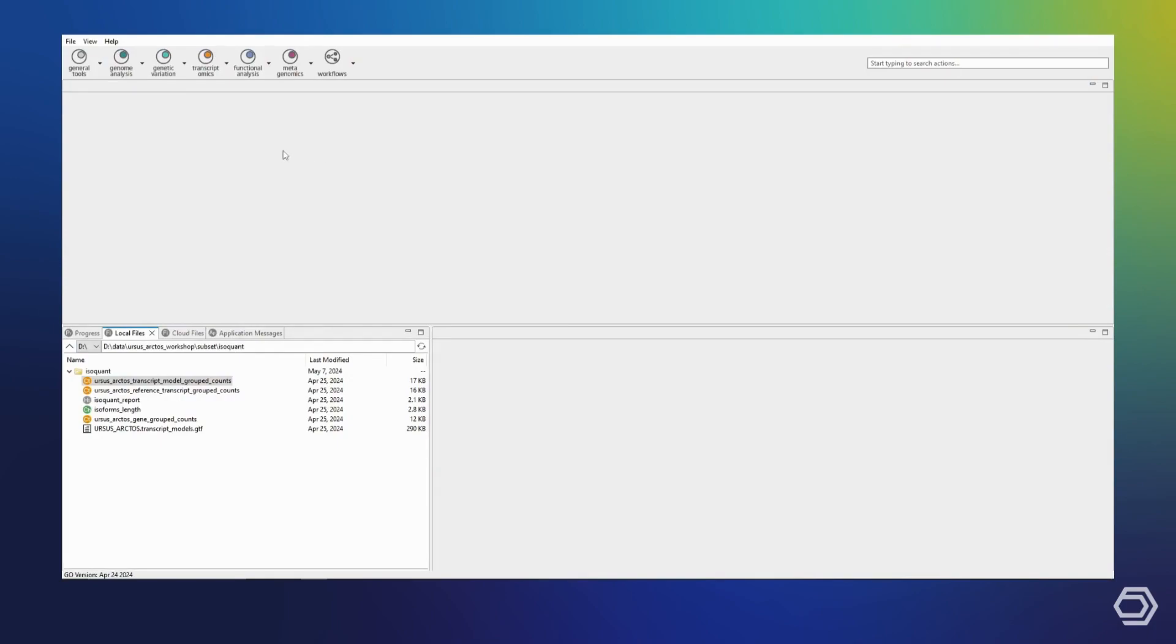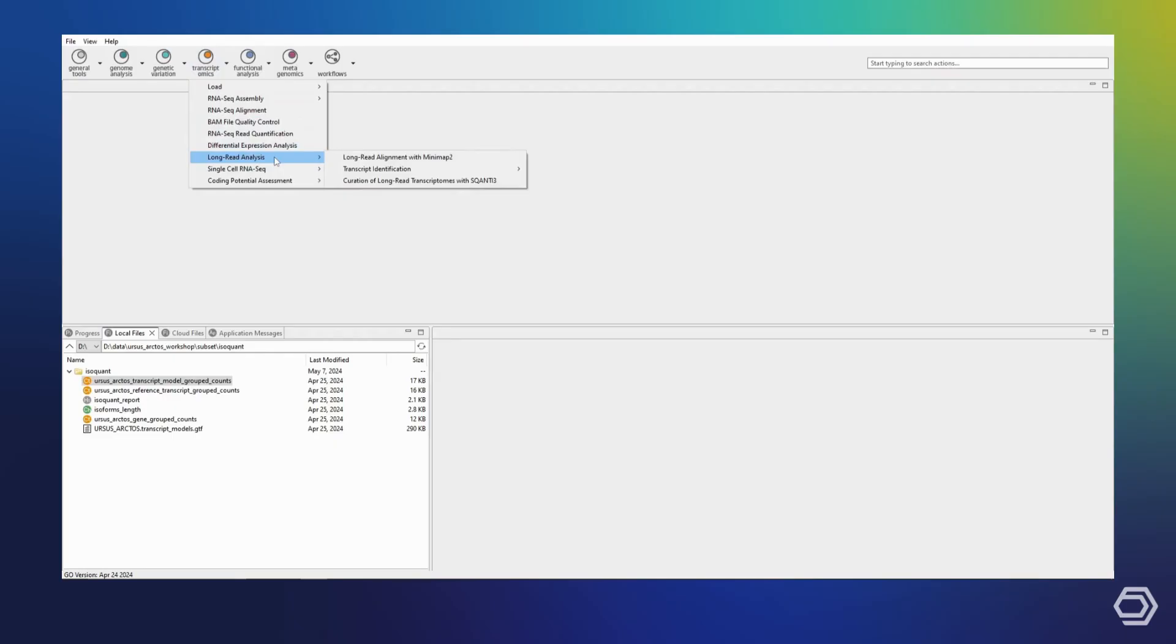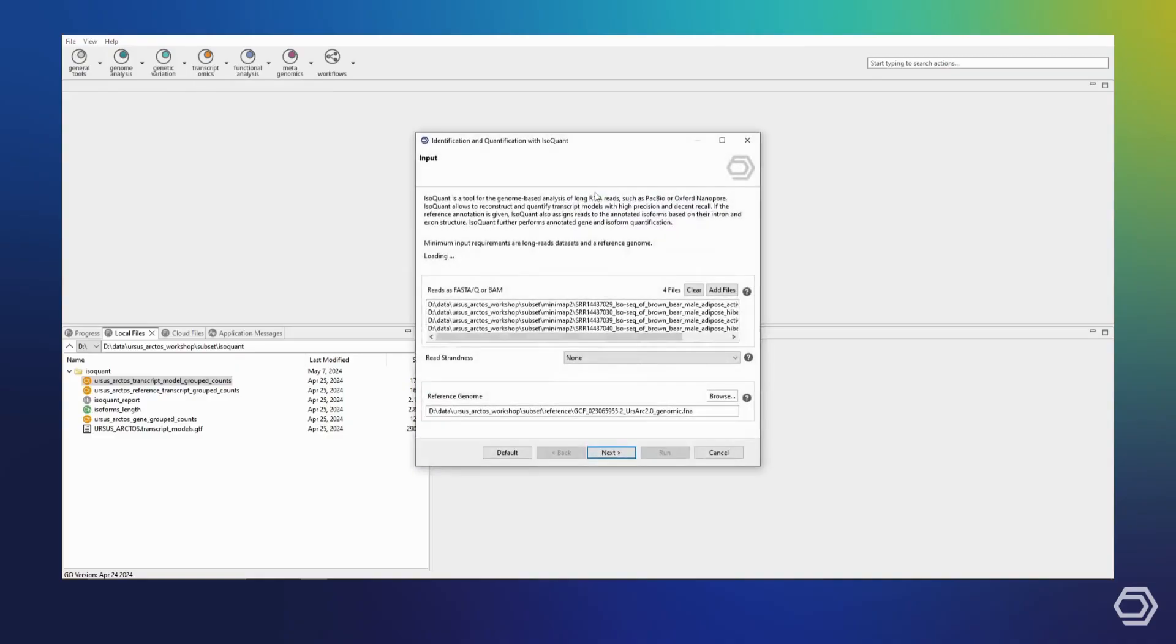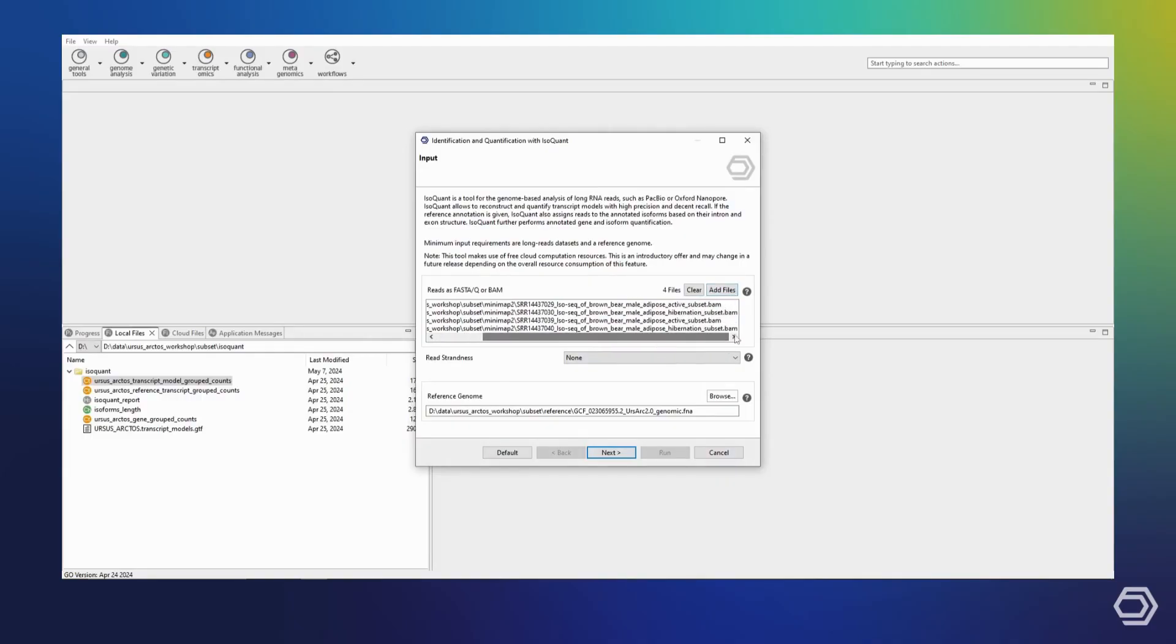Now that we are in OmicsBox, we can open the transcriptomics module, go under long read analysis and transcript identification, where we can select identification and quantification with IsoQuant. Here, I can select my input files in FASTA or FASTQ or BAM format. Since I have already previously used minimap2 to align my reads to a reference genome, I can directly use my aligned BAM files.